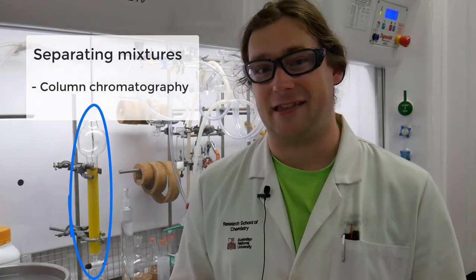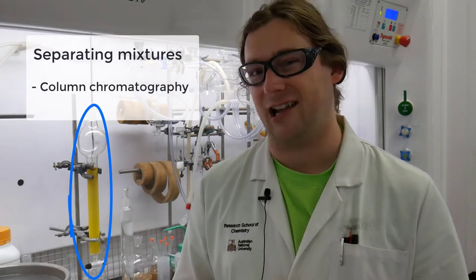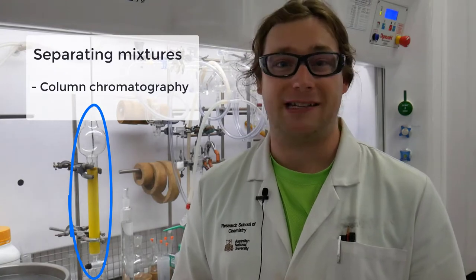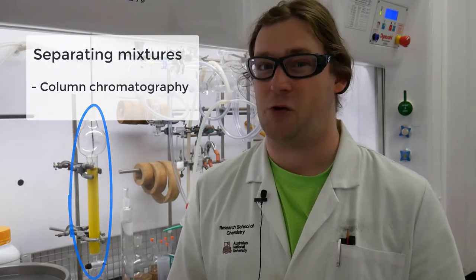Now you guys might think that chromatography is only really useful for separating different colors of pen ink, but in synthetic chemistry we can use it for so much more than that.